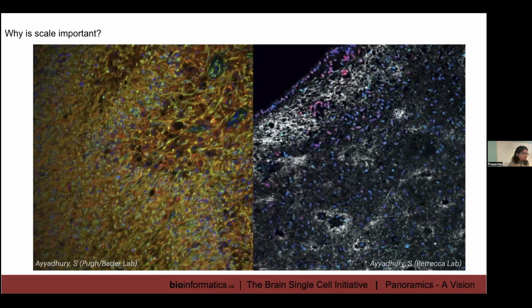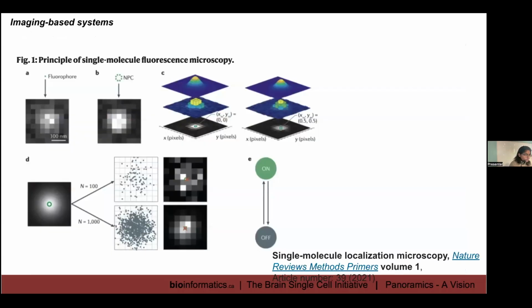Evaluate all of this, and it should be guided by how much you understand your tissue structure and the layout of your tissue. If your main objective is to study blood vessels, maybe your bin size should be guided by the average size of your blood vessels. Who says that you can't do that? There are no standard rules when you want to do any kind of science. So these are all the avenues in which you can explore.